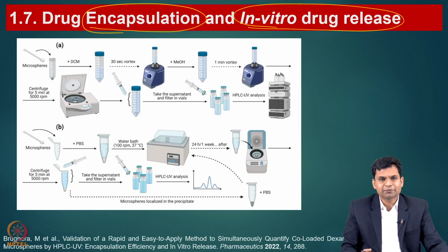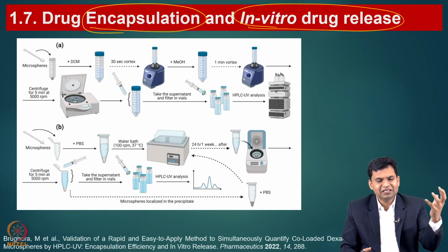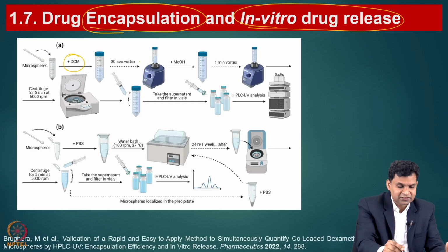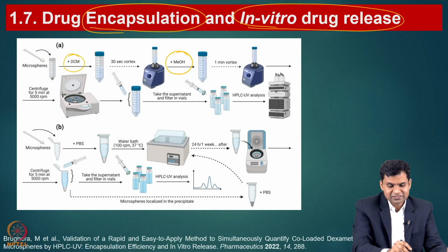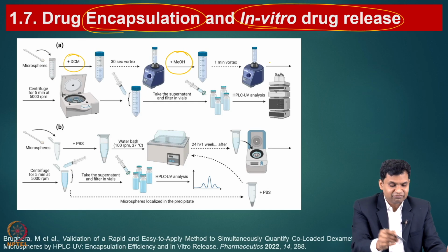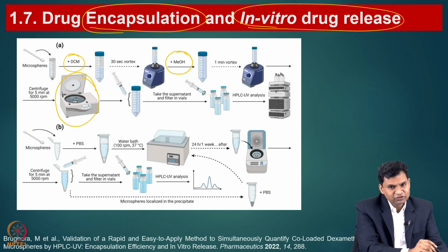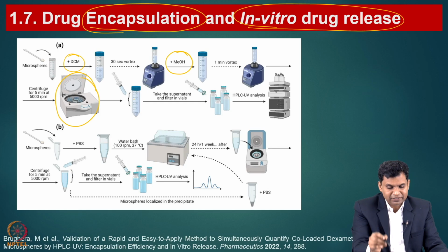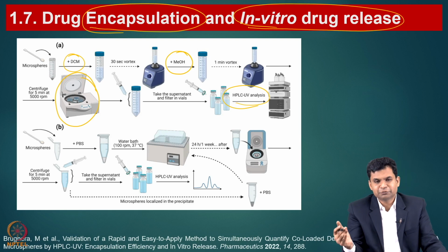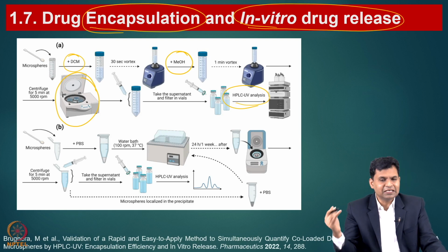So, in drug encapsulation, after developing any novel drug delivery system, it needs to be dispersed in the required solvents. After that, we do the mixing, follow centrifugation, and take the supernatant and check the quantification of the drug which is loaded as well as unloaded, by using HPLC or UV or any type of quantification technique.